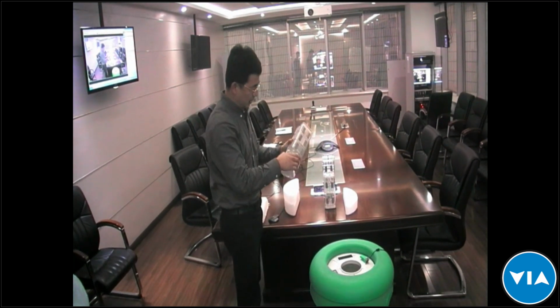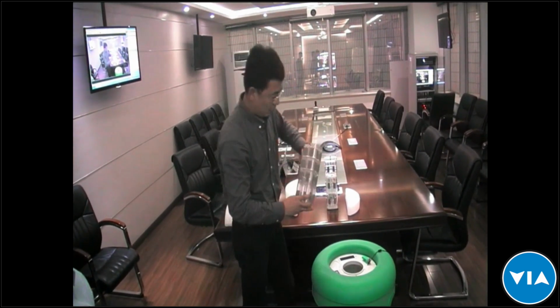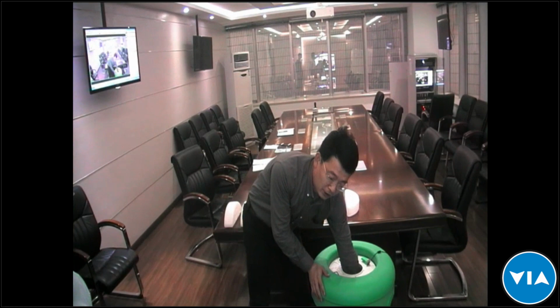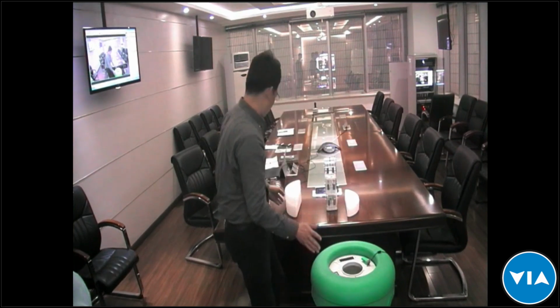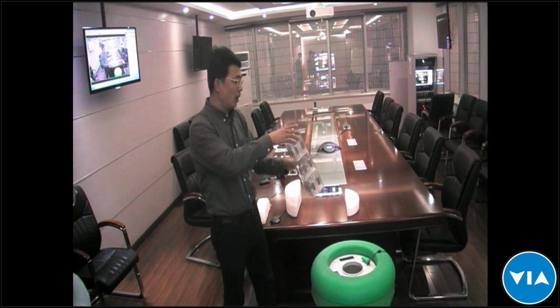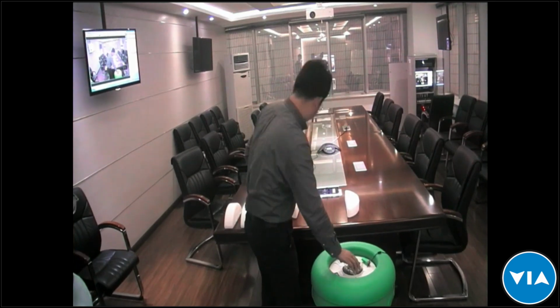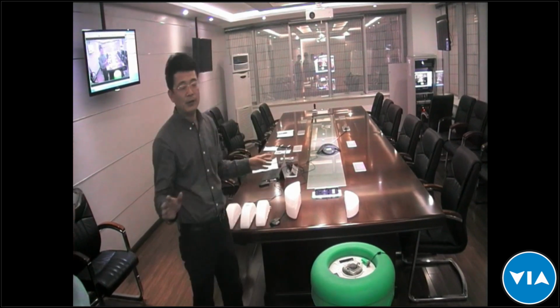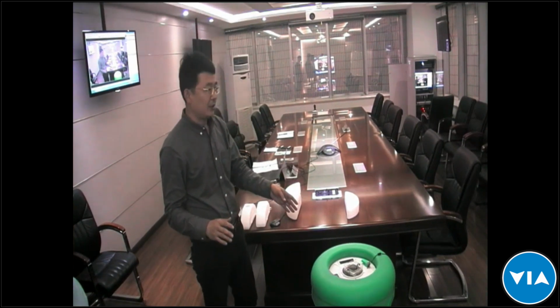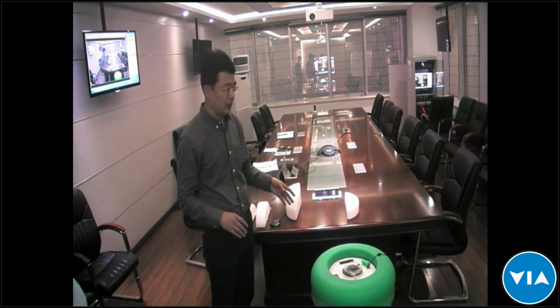And then the other side one, you push it against the other inside wall, and that leaves a space for the bigger one. You can place the large one in the device. That's the whole step for the ice block and vaccine deck. I think I have demonstrated all the steps for the ice block and vaccine deck.